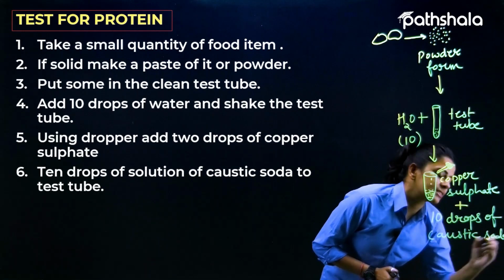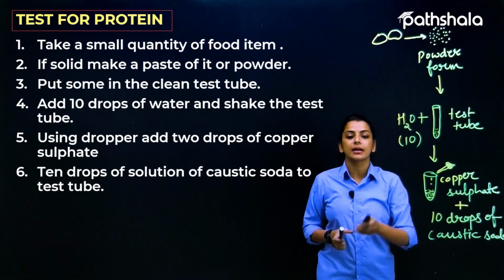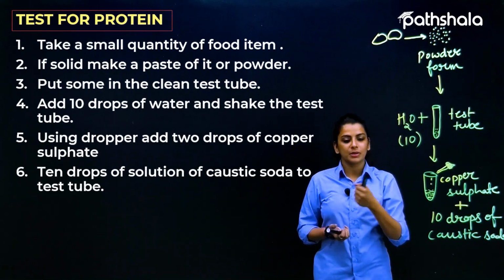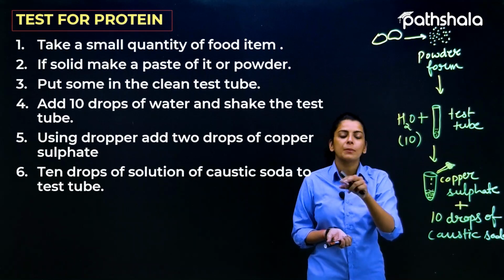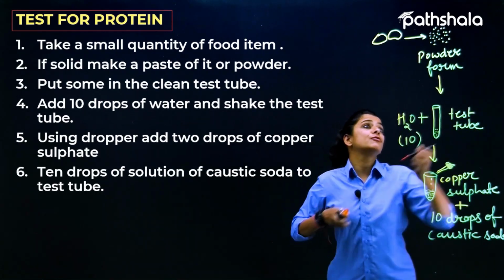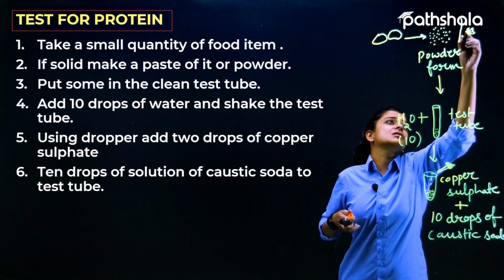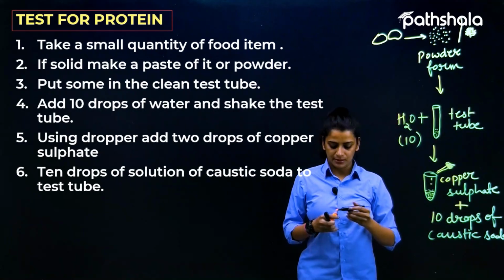So yes, अब एक बार और रिवाइज कर लेते हैं क्या क्या हमने यूज किया है. फर्स्ट हमने लिया है small amount of food content in a powder form. आपने उसको mix कर दिया अच्छे से so that it becomes a little powdery, right? Or a paste. It can be in the form of powder also, or it can be in the form of paste also, right? So this is just a rough diagram of what a paste form will look like, right?